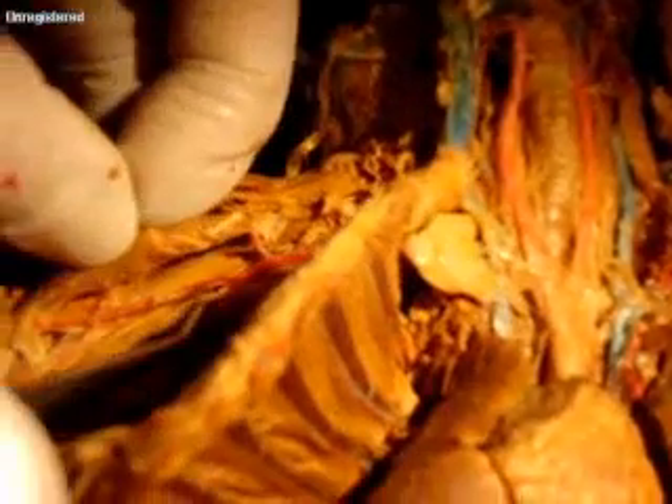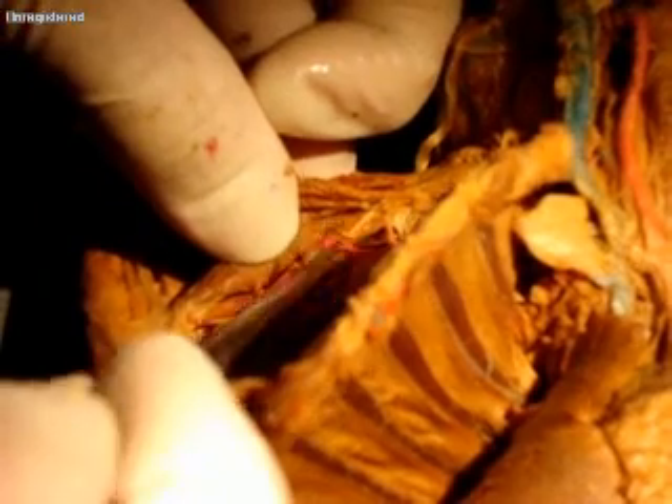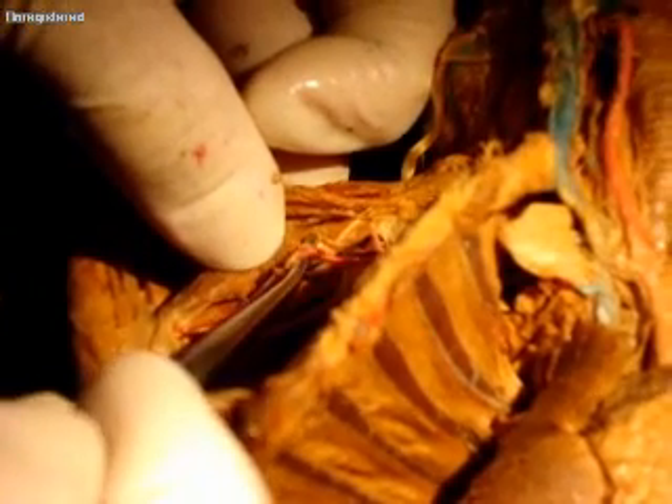That continues on — the subclavian continues on and becomes the axillary. Then the axillary goes into the arm and becomes the brachial. Everybody all right with that?